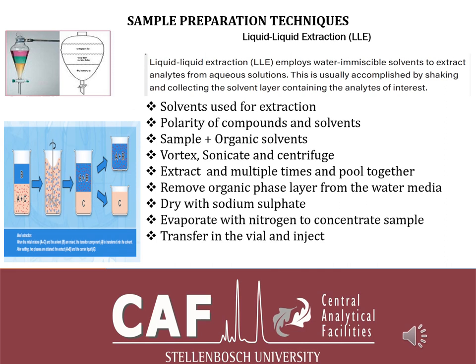of interest. And then also it is important to add a little bit of sodium sulfate to dry your organic solvent, because the water that might be retained is not good for your GC, or it might also affect the sensitivity of your compounds.